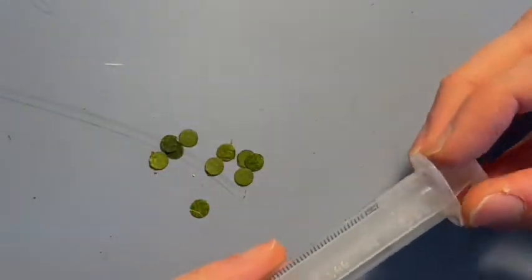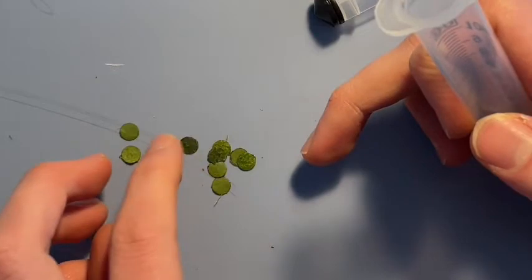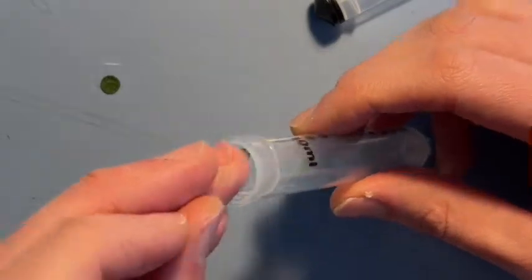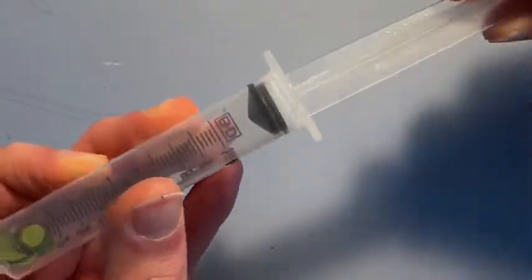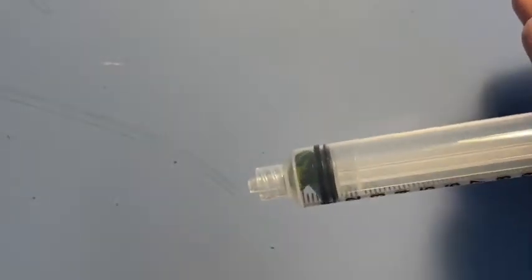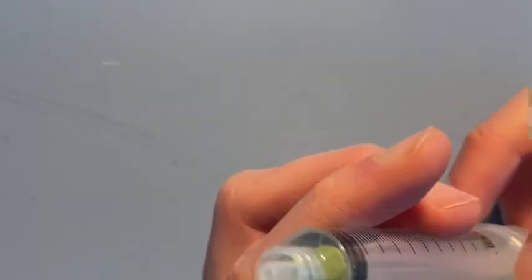Okay, so now that I've got my group of 10 little leaves, I'm going to put those discs, 1, 2, 3, 4, 5, 6, 7, 8, 9, 10, inside of my syringe. The parts of the syringe: right here I'm holding the barrel, and the hub is at the end. I'm going to put the plunger back into the barrel. Be careful to remind the students not to crush the leaves too much. We're just gently pressing them up against there. We're not crushing the leaves.